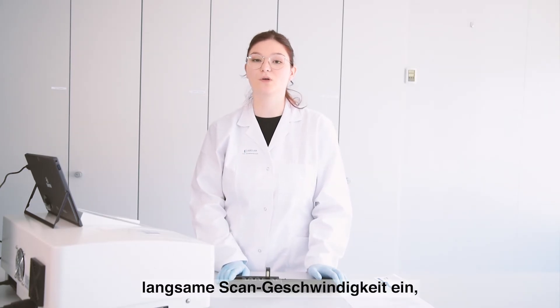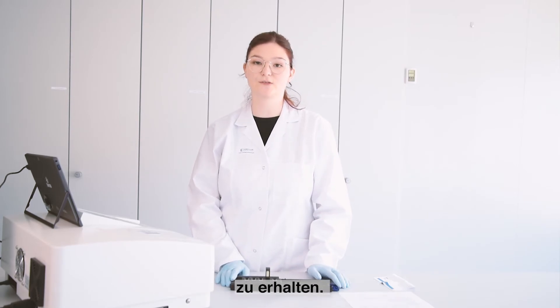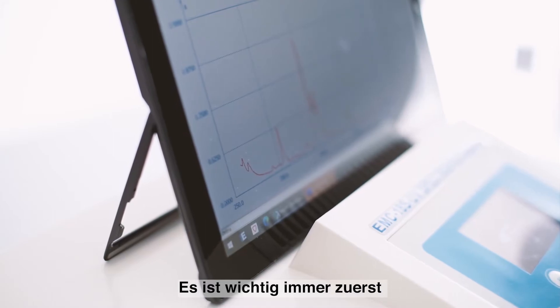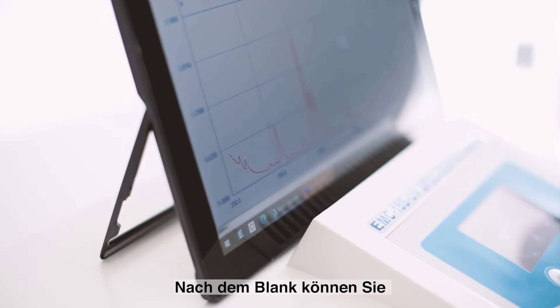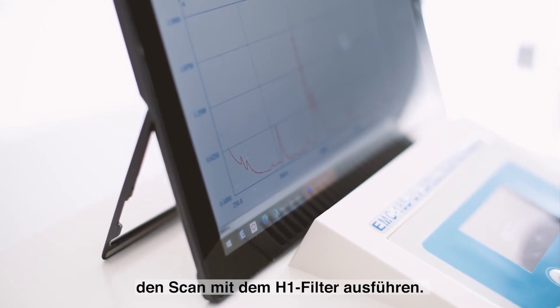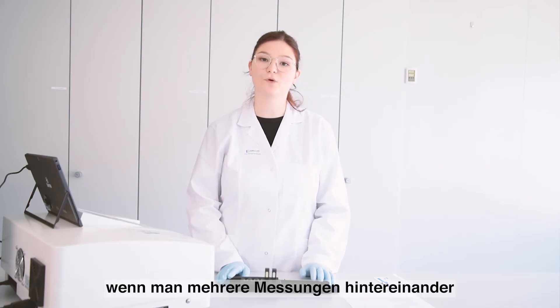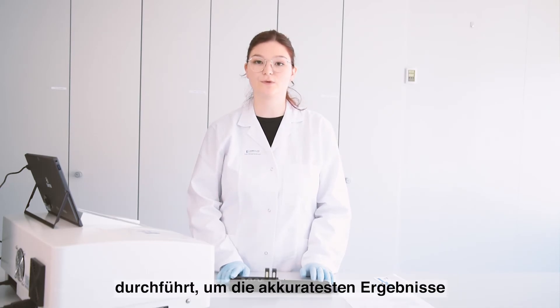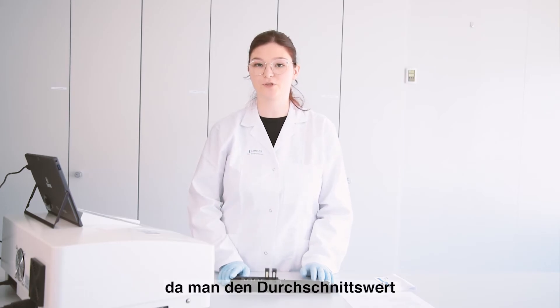You should always select a slow scanning speed and small intervals because this will lead to the most precise results. Always carry out the blank at first, and then after the blank is done you can do a wavelength scan with the H1 filter. Be sure to take several measurements again, as taking the average will lead to the most accurate results.